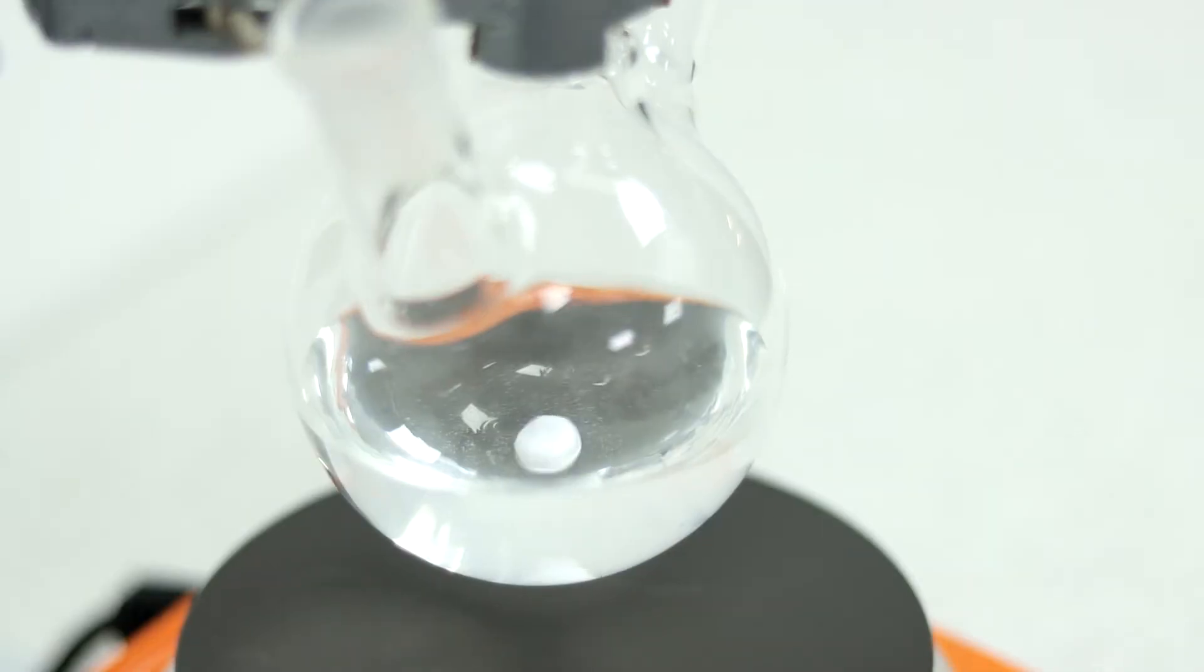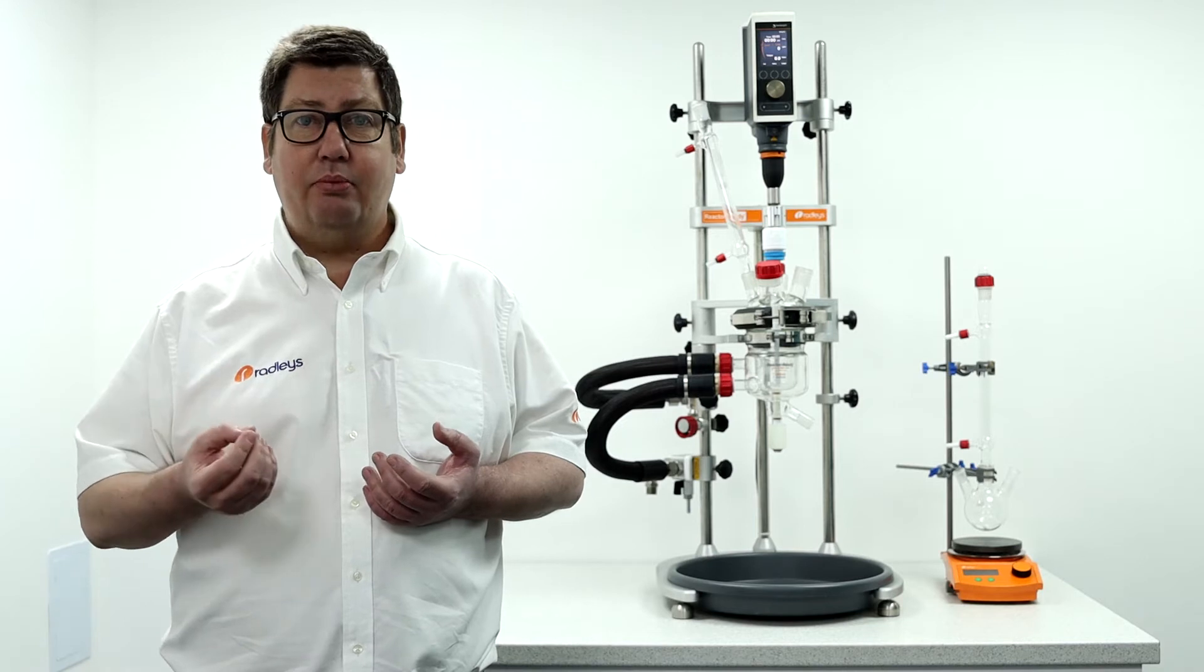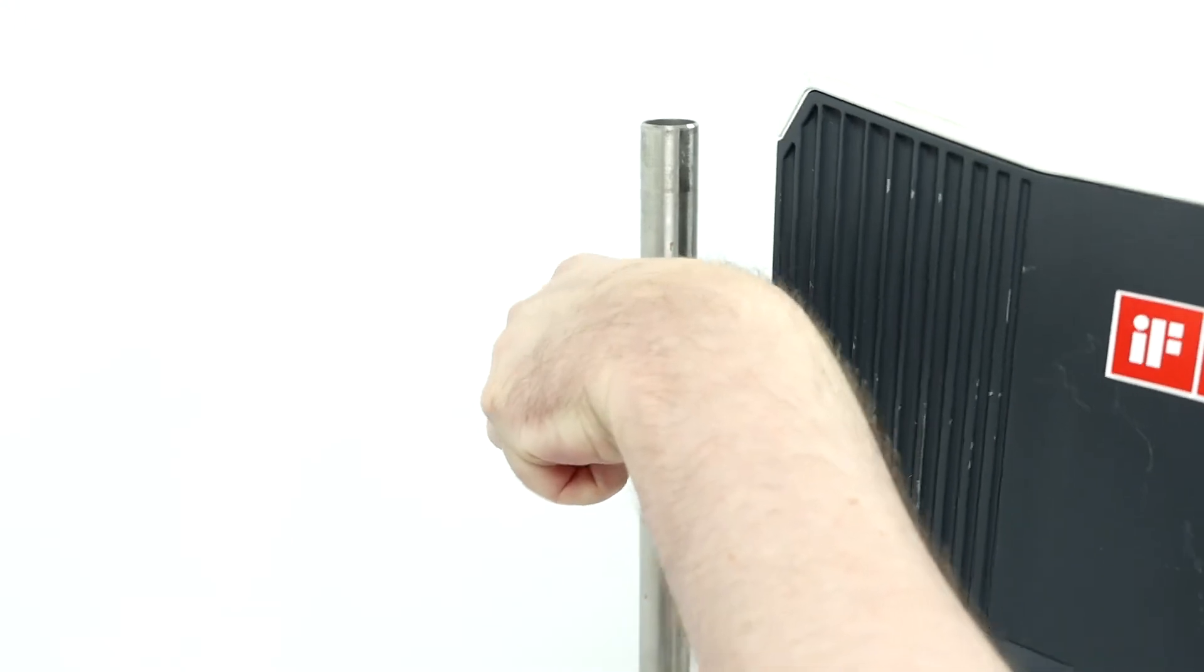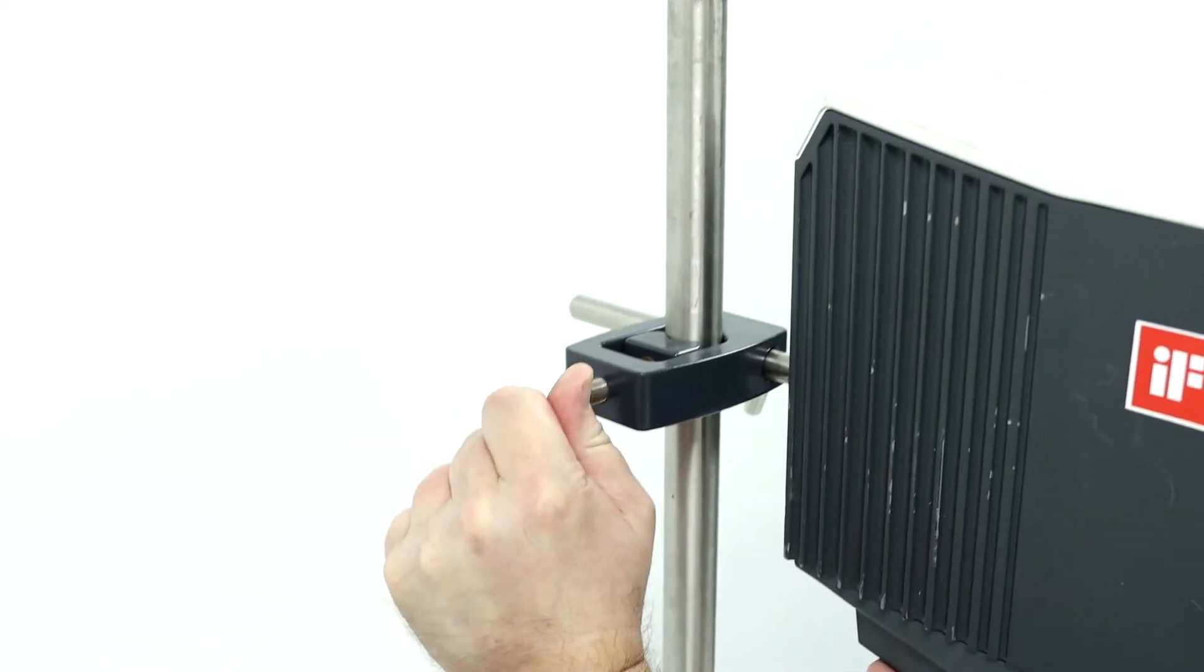We often find the chemist might prefer to use magnetic stirring with stirrer bars on a scale of 50 ml, 100 ml, 250 ml for example as opposed to overhead stirring where traditional systems may be more difficult to set up.